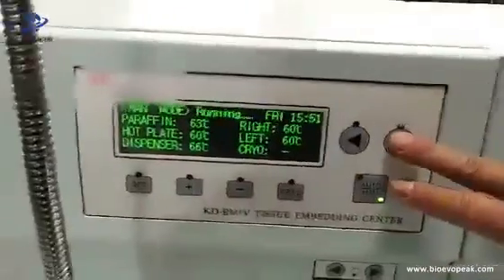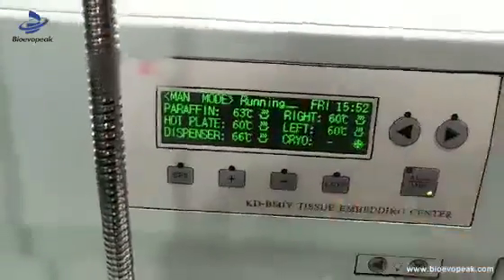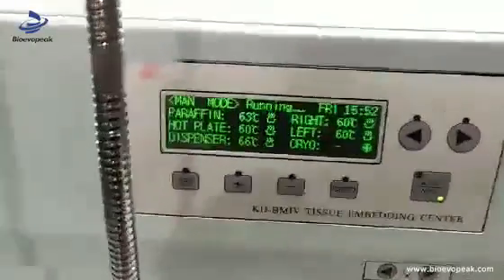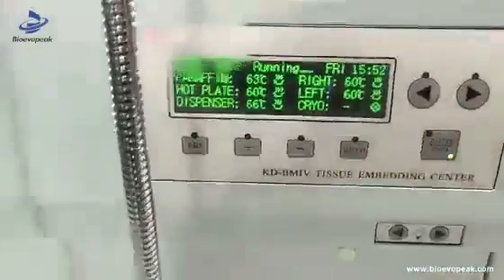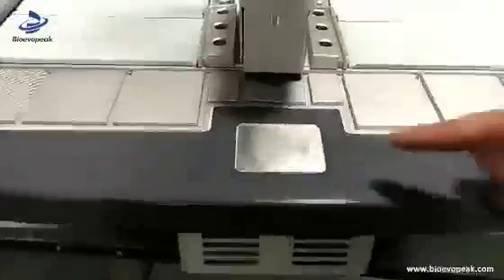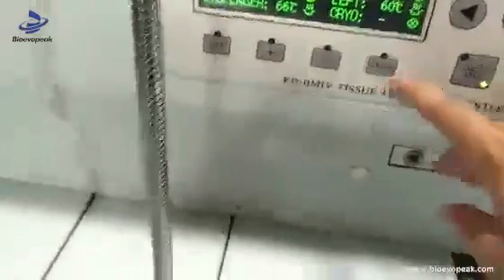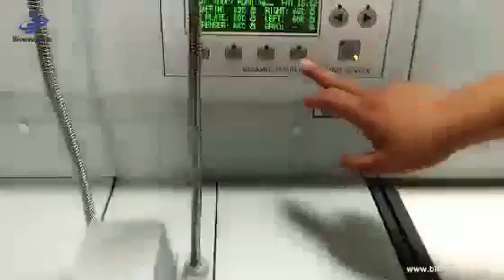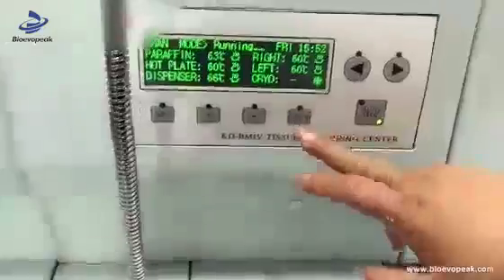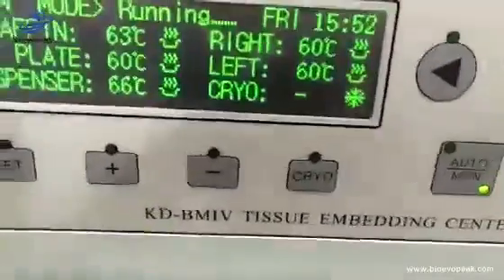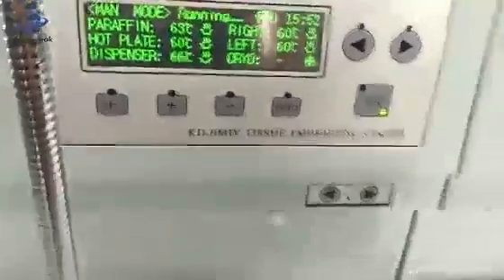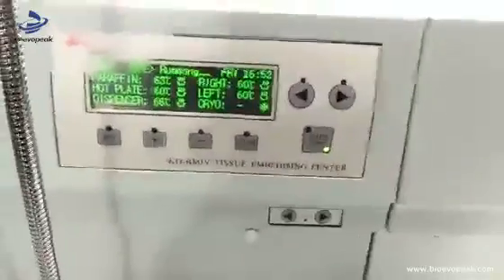We can also set the automatic mode. First, go to the manual mode interface. The cryo key is for the small cooling table. When you press this key, the cooling table can make cooling itself. When you see the snow signal, the small cooling table can work automatically.